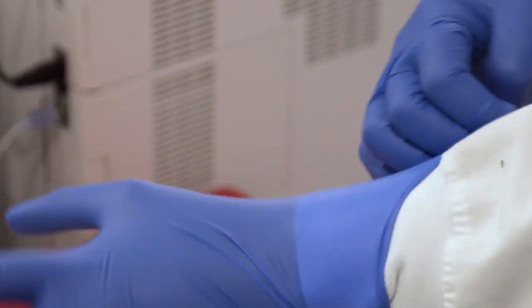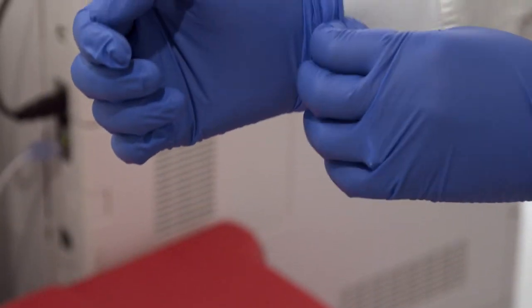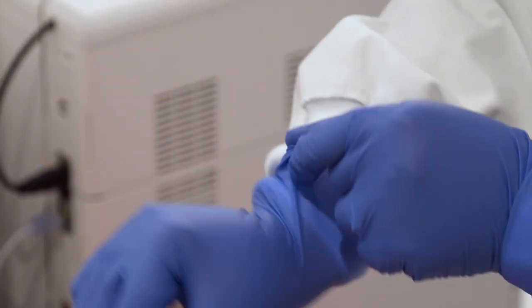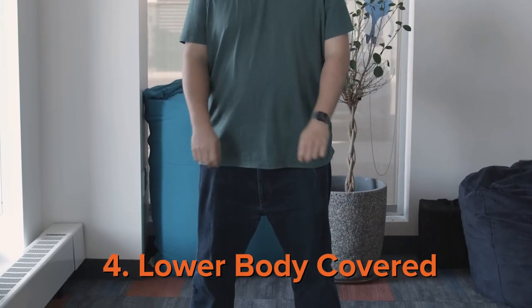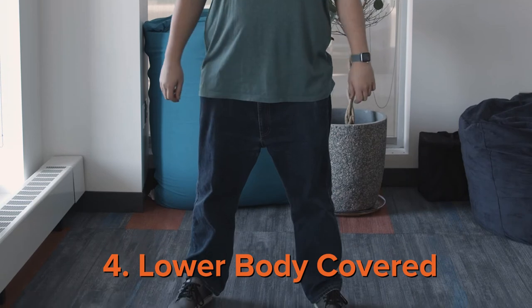Here's a pro tip: if you tuck your sleeves into your gloves, you can protect yourself from spills or accidents. If you have a spill running down your hand, it won't go into your sleeve because your sleeve is tucked into your glove. Your lower body should be completely covered in clothing to protect yourself from hazards such as spills or other potential accidents that can happen in the lab.